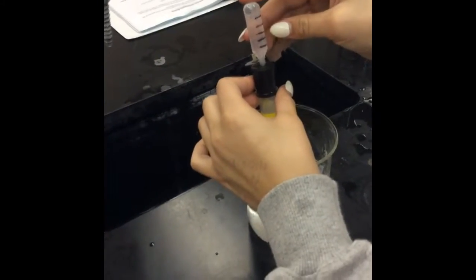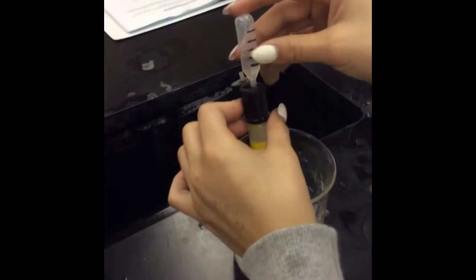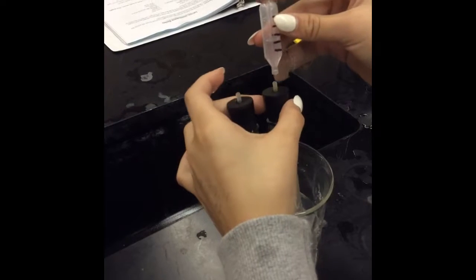We filled the pipette bulb with water and put the opener in the water. We filled the end of the pipette over the H2 generator until the third line, then switched it over to O2 until the water was gone.